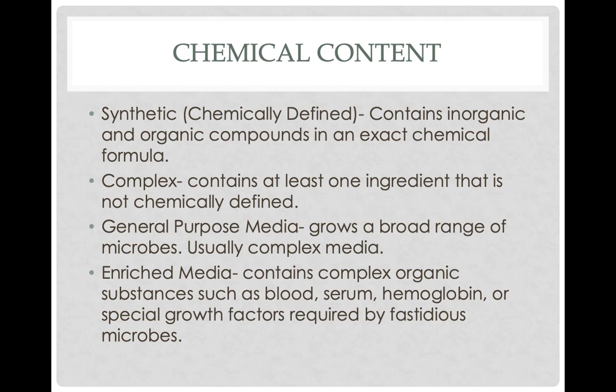So the other way that you define agar is what's inside of it. Is it something where you can look at the back of the bottle and go, I can look at every single ingredient inside of this and know the exact precise formula of it? There's a very common type of media that we'll talk about in the lab called mannitol salt agar. Mannitol is a type of sugar.